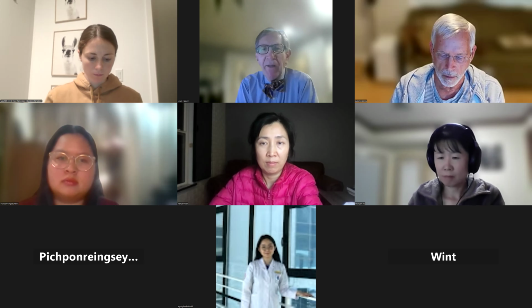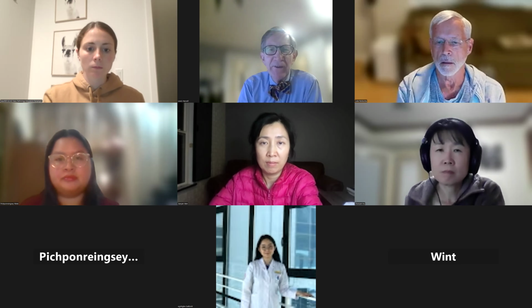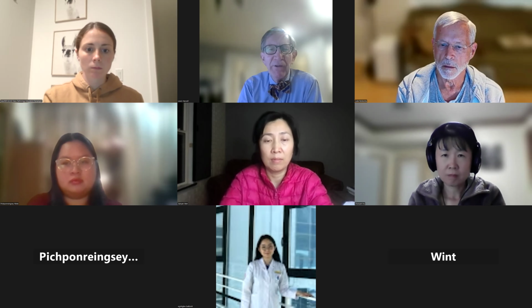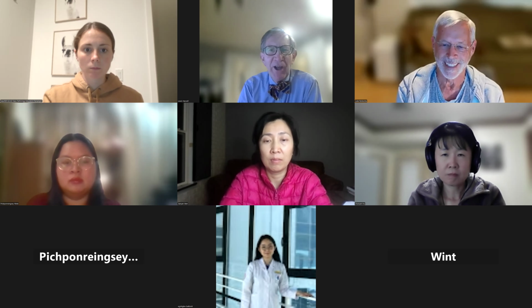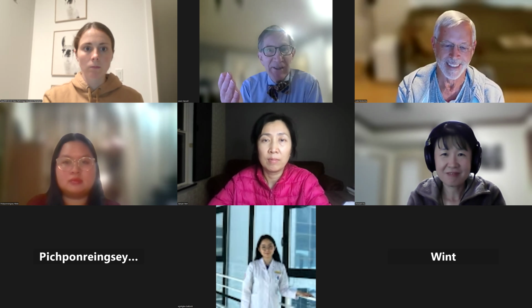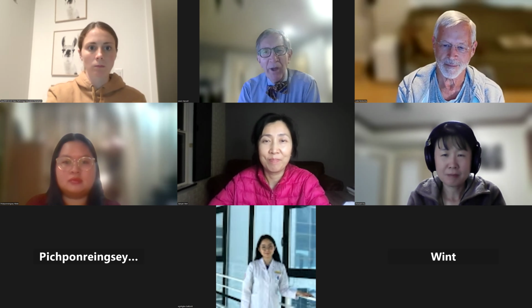Just one quick comment on that. Polarizing lenses may be very expensive if you have to buy the fitted ones for your particular microscope. But for many years, I got along very well with just a couple of very cheap plastic polarizing pieces of plastic, essentially, that I put one on top of the slide and one over the light source.